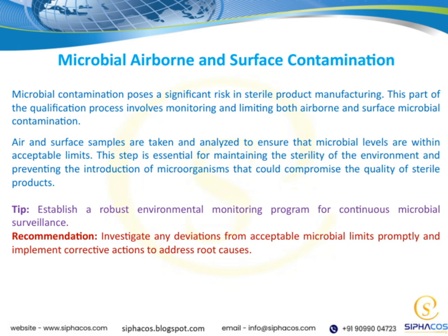A key tip here is to establish a strong environmental monitoring program that provides continuous microbial surveillance. This way, we can detect any issues early and take action promptly.